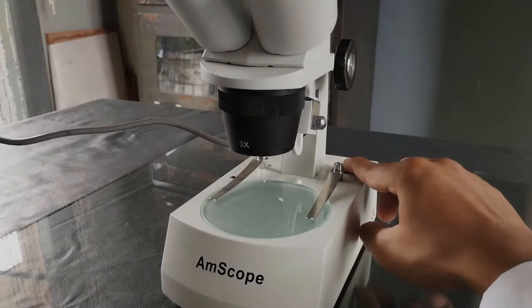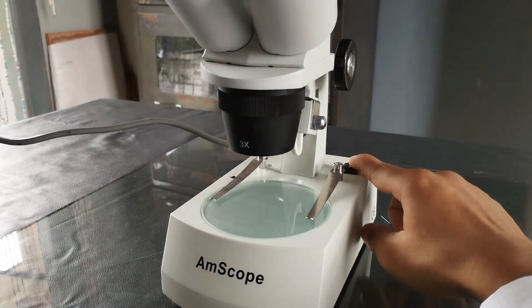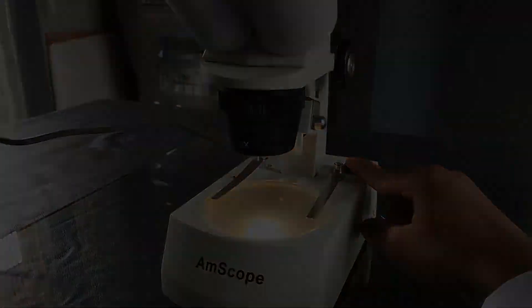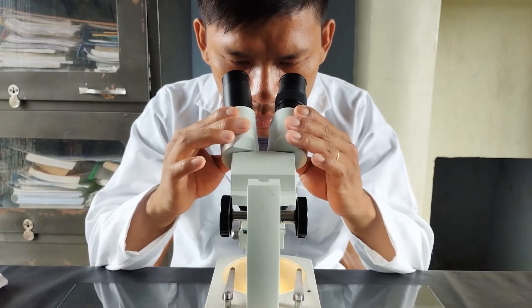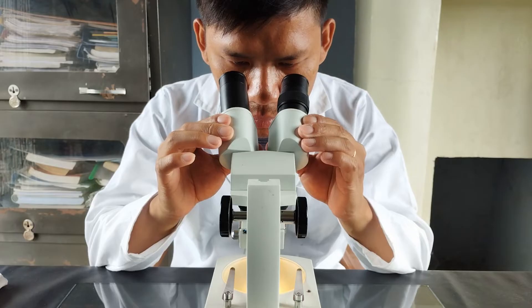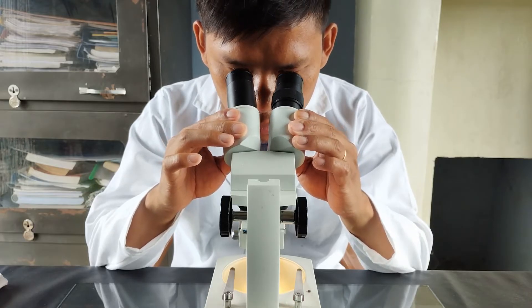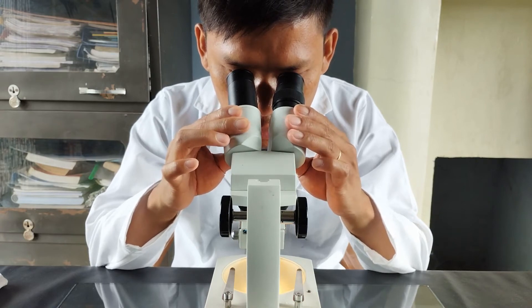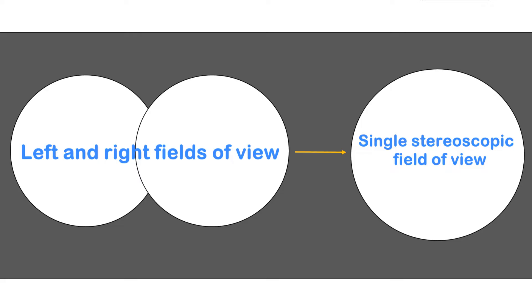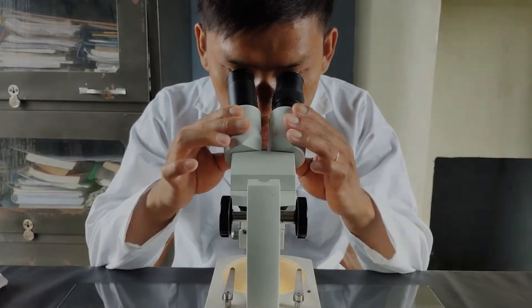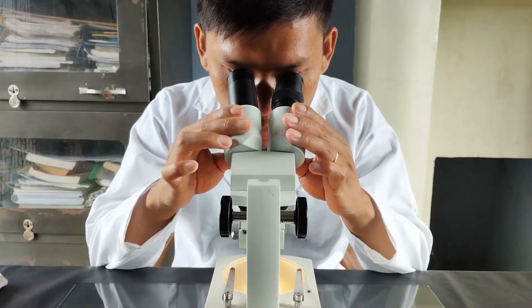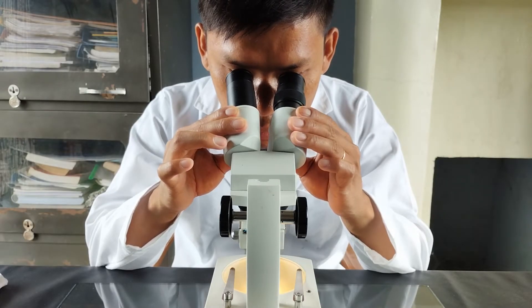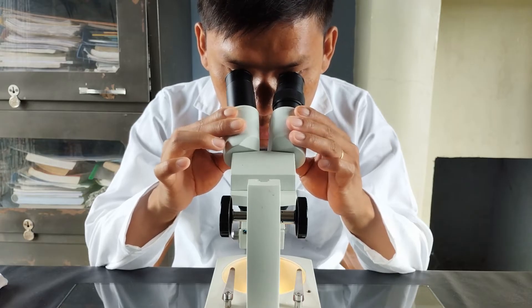To use the Stereo Microscope, first turn on either the top or bottom light source. Position both eyes right in front of the eyepieces and then adjust the eyepiece distance relative to the distance between the left and right eye. Continue pulling apart or converging the eyepieces until the two circular fields of view seen by both eyes converge to appear as a single larger stereoscopic field of view. Just like the compound binocular light microscope, it takes a bit of time and practice getting used to viewing through the microscope with both eyes open and clearly seeing a singular field of view.